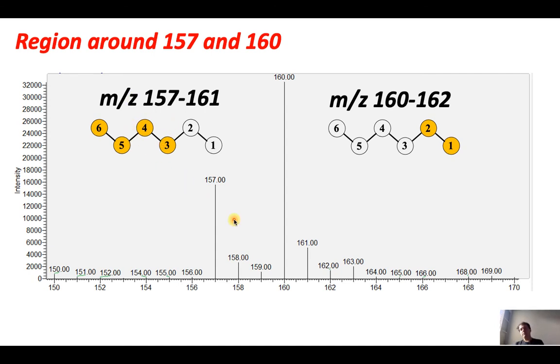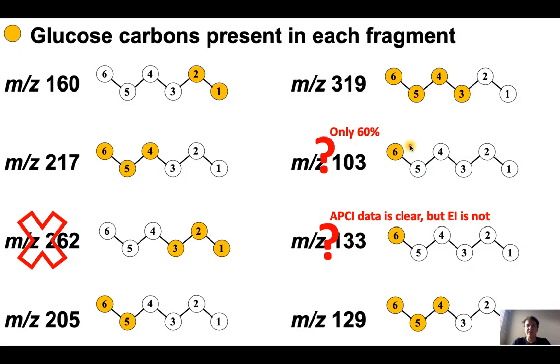So we managed to estimate the relative abundance of the 160 and 161 of this fragment here. Then we discount and get the total 13C enrichment in this fragment, because it's really important: if you see the fragments that you can use, none of them contains the carbon 1 and 2.